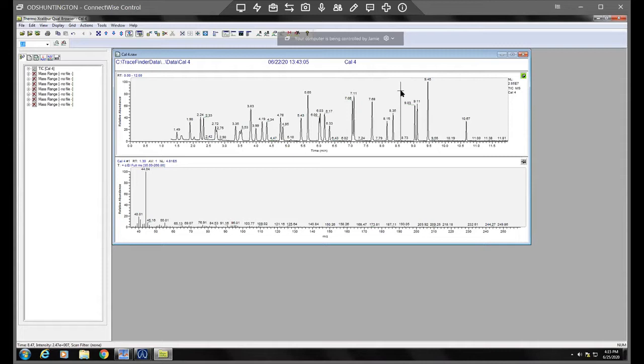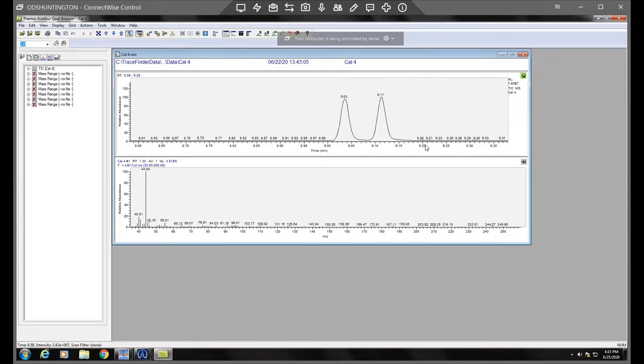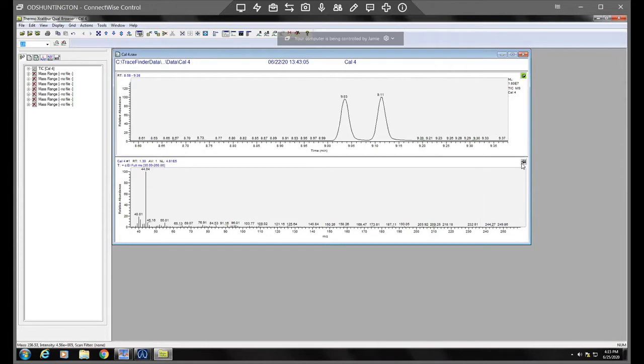I want to zoom in. So what I'm going to do is just click and drag my peak of question here. So I'm going to just do that and it'll zoom in for you. So it just gives you a little bit better look without seeing everything.